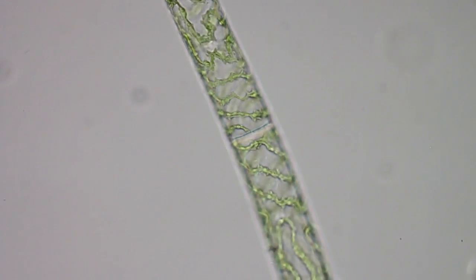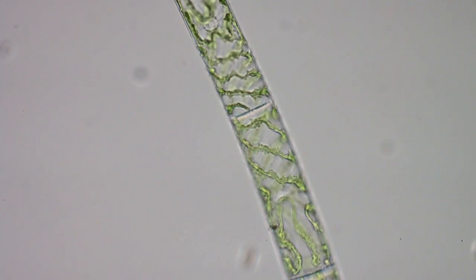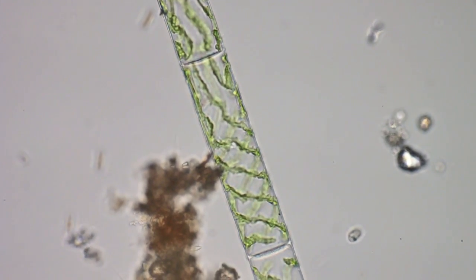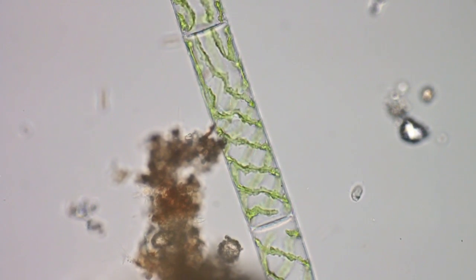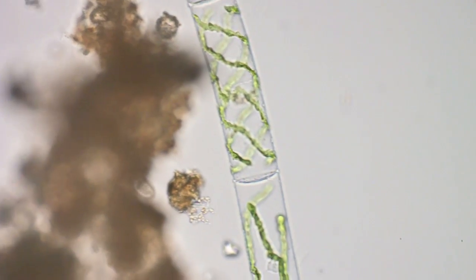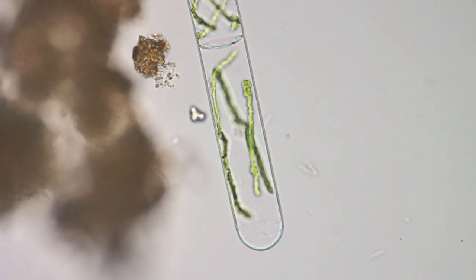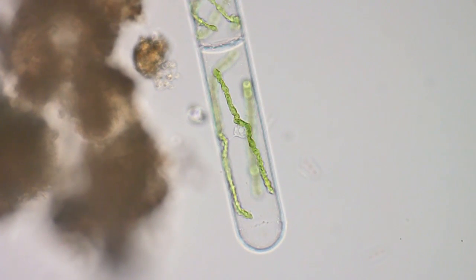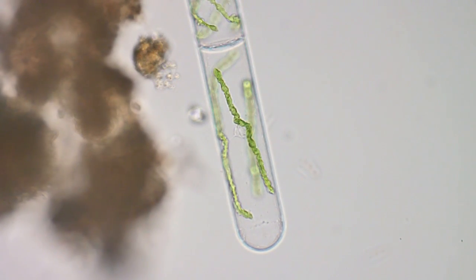Kind of an interesting structure - there's nothing else like it as far as I know. Some other interesting bugs in the background there. This brown stuff on the left is just some of the scum at the bottom of the jar - decaying vegetable and animal matter.